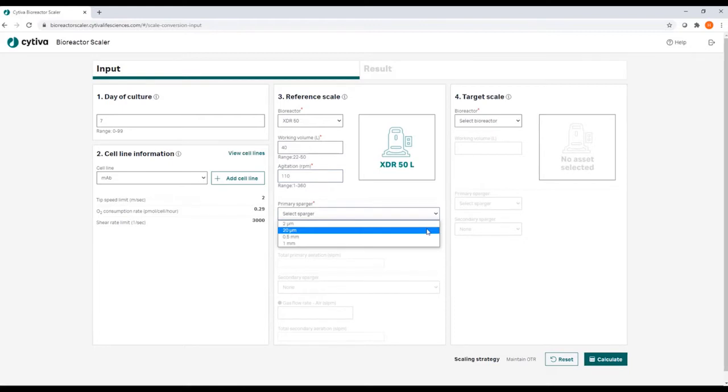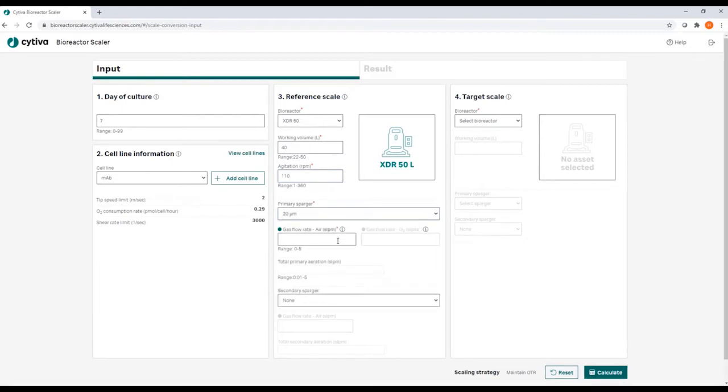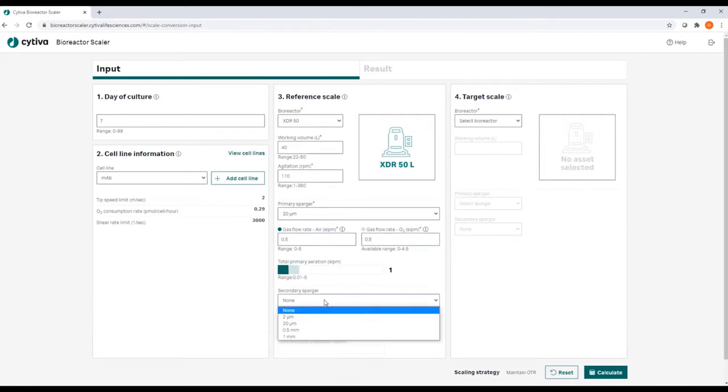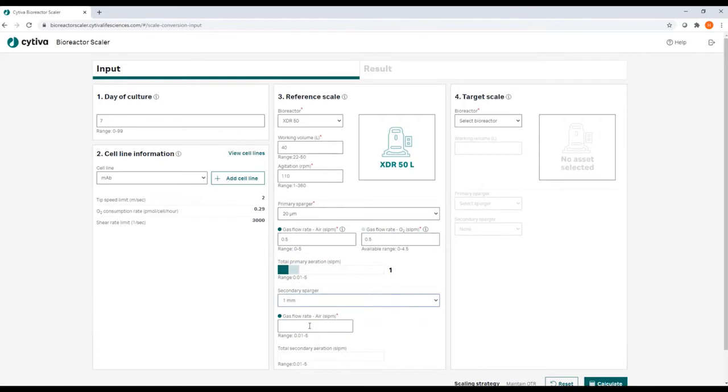Next, you enter the working volume, the agitation, and the sparger configuration, starting with the micro sparger and the airflow of air and oxygen, and then moving on to the macro sparger and the flow of air that is going through that sparger.